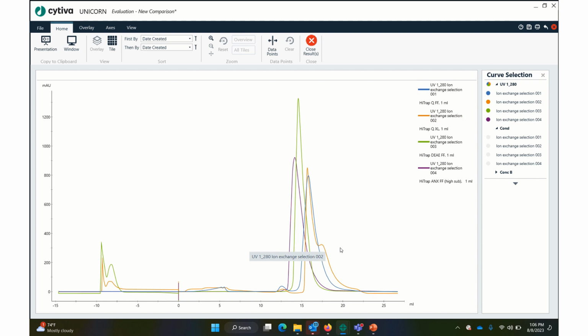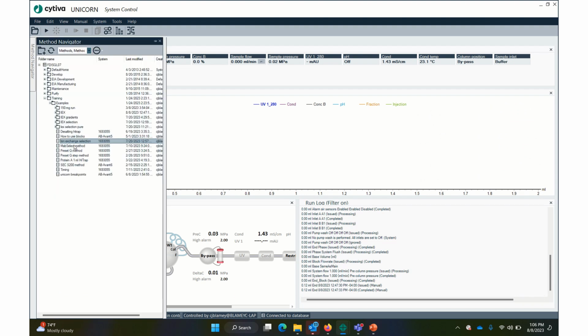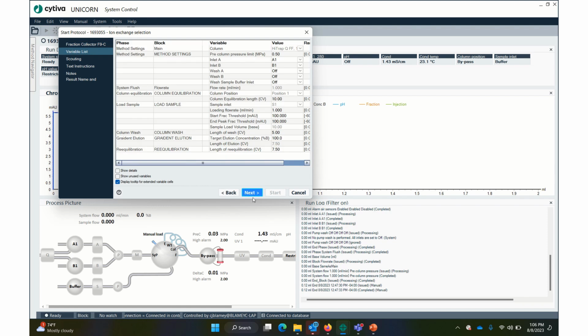I happen to have a little sample left. I have enough for 2 more runs. So I kind of want to show you guys how scouting can get multi-dimensional. So we're going to go back to the control module, and we're going to set up another run. So ion exchange selection. And we've already done 1 run.